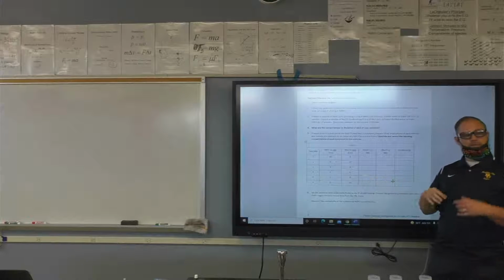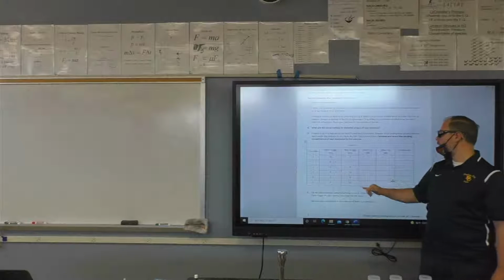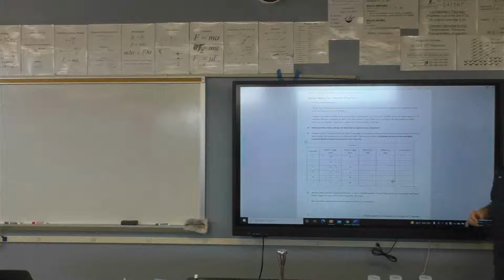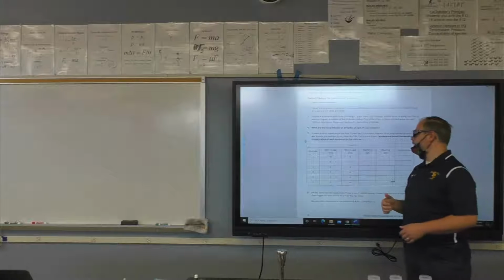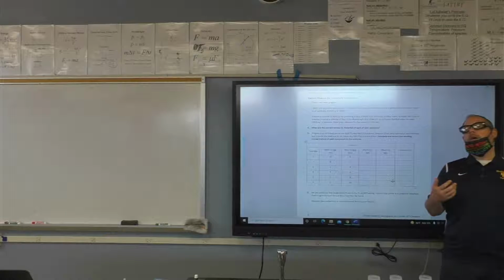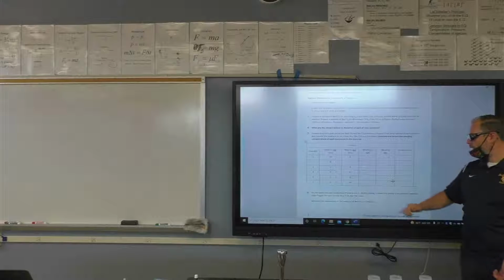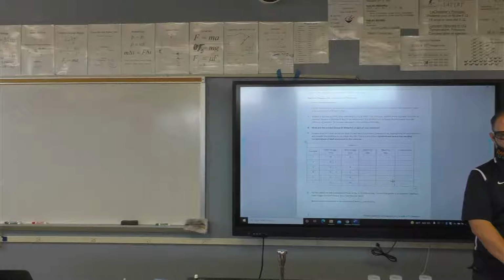So what you're going to get is a spectrum going from all sodium bicarbonate to all sodium carbonate. Okay? And then that's going to give us our conductivity. We're going to basically plunge the conductivity meter into the solution, and it's going to give us a number. And hopefully the number will create a spectrum that we can then graph. And we're going to slap the graph on here somewhere. Okay? So far, so good?